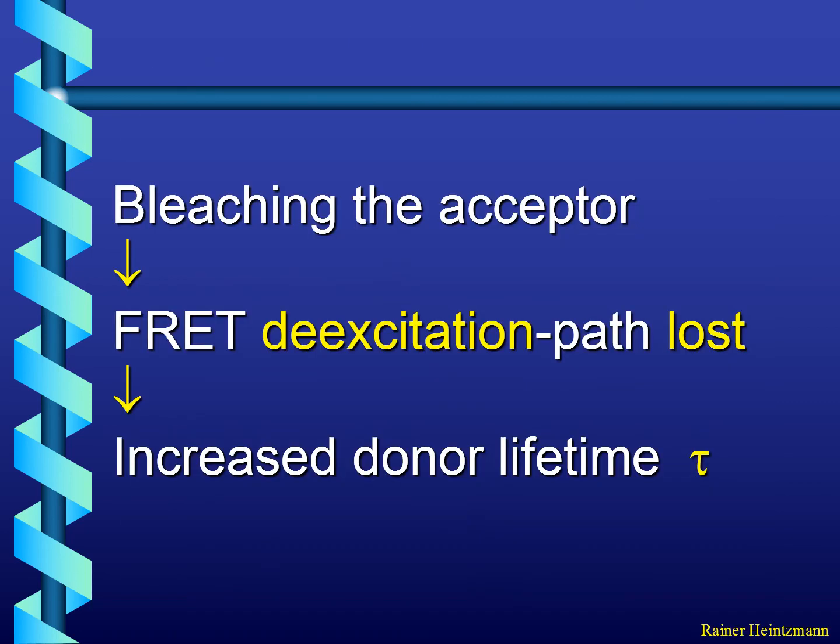So to summarize this, if you bleach the acceptor, you're losing the FRET de-excitation path and you're increasing the donor lifetime.